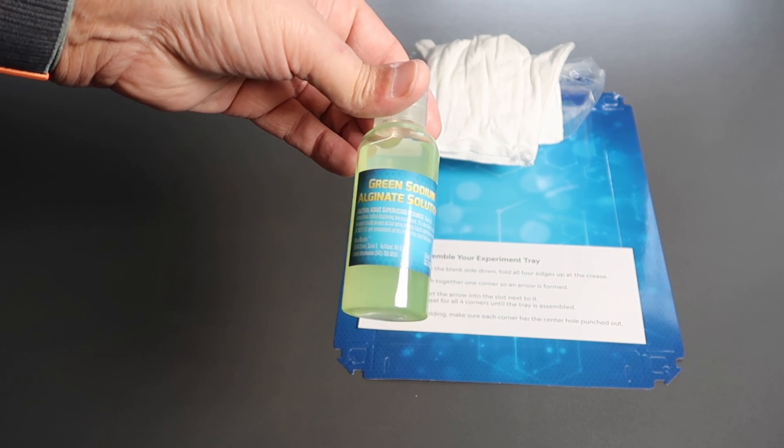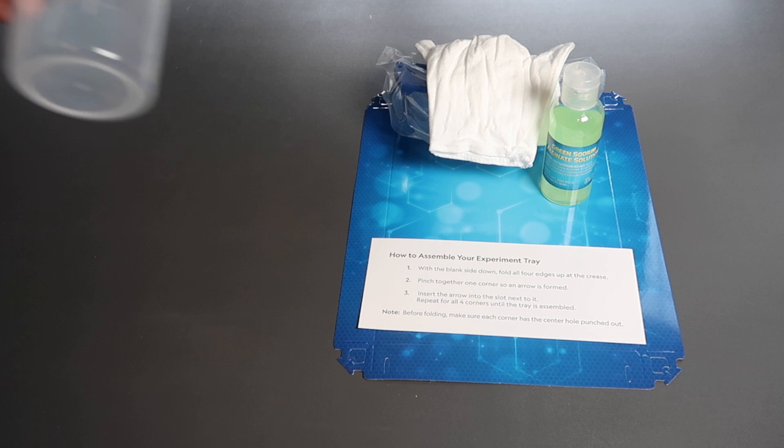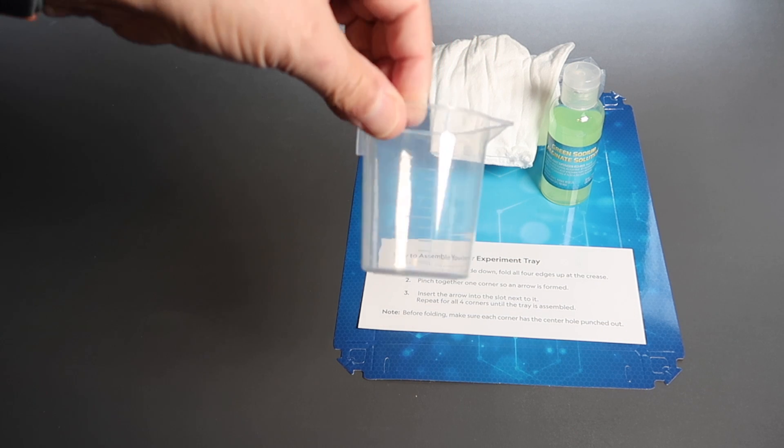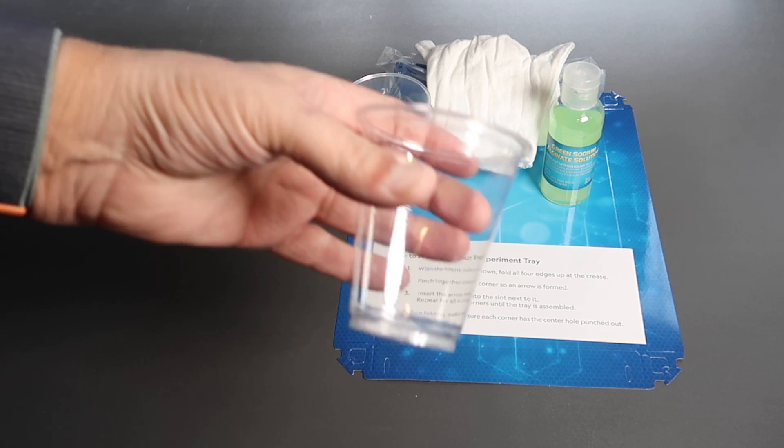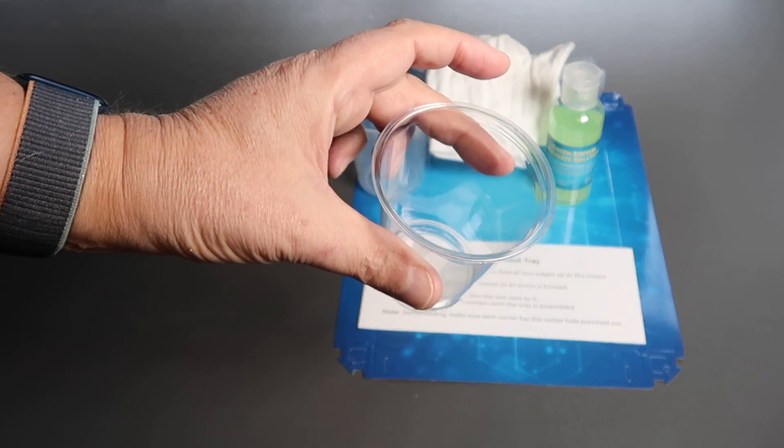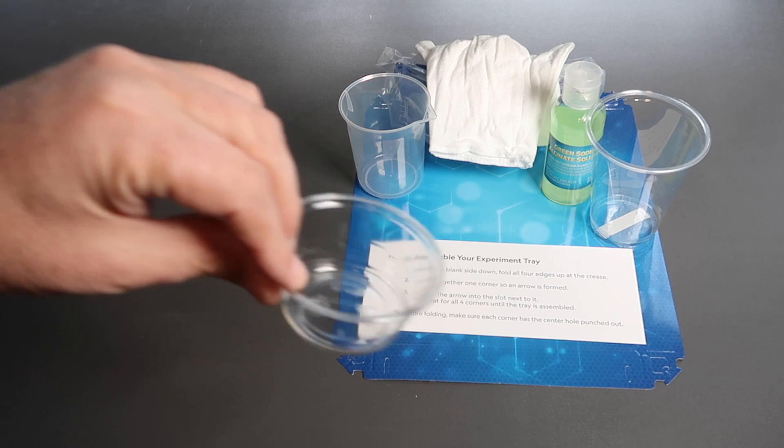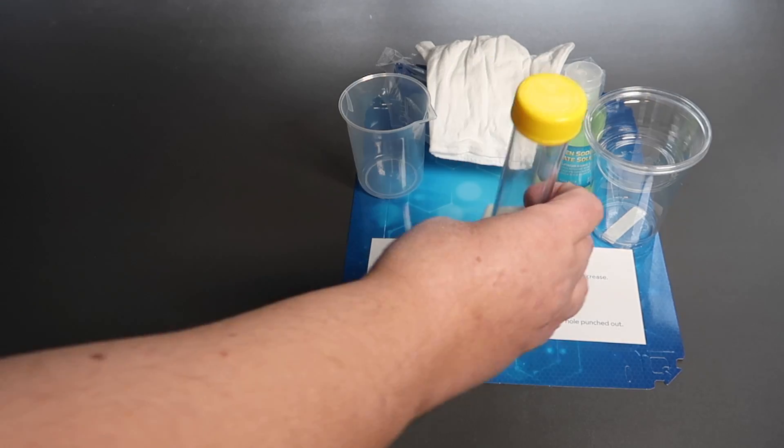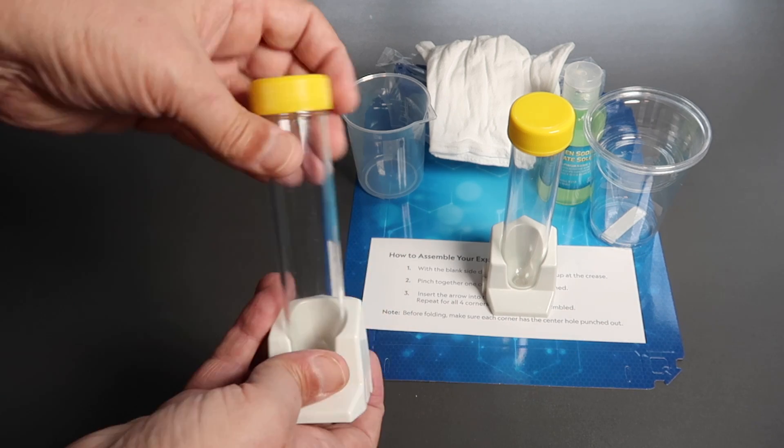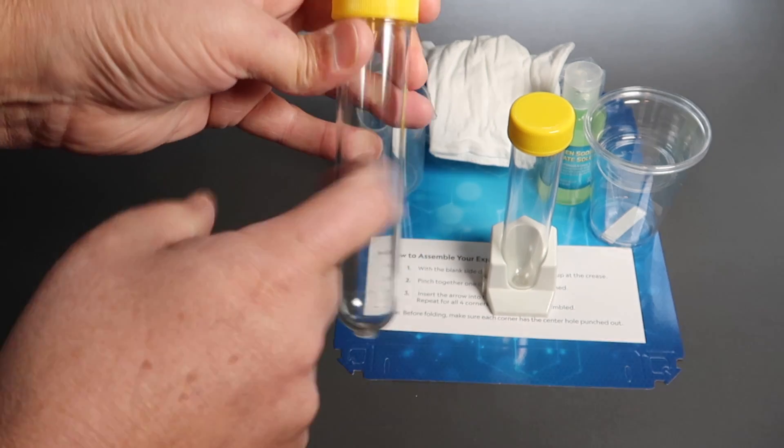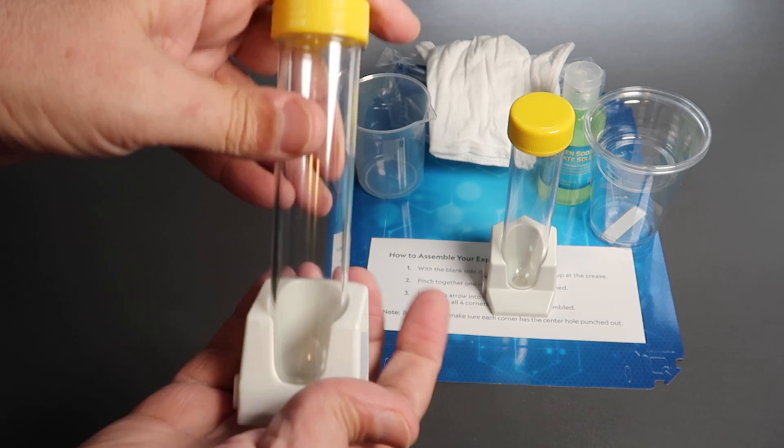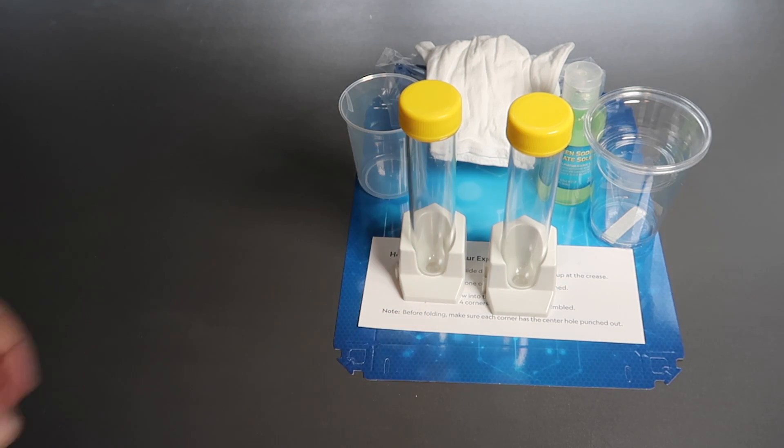Green sodium alginate solution, small beaker, a larger plastic cup, a small plastic cup, and two very solid test tubes with screw-on lids and a nice stand to hold them upright. Very solid quality. I'm pleased about that.